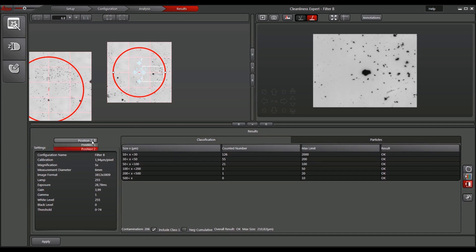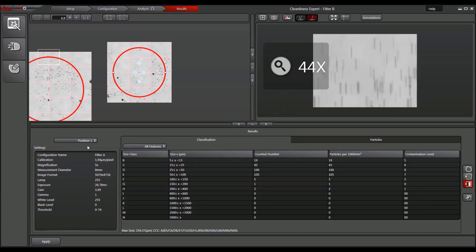To review another filter sample, just select it from the drop-down menu. The software automatically centers the selected particle.